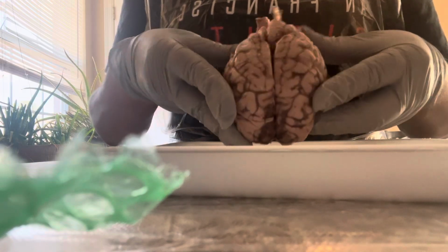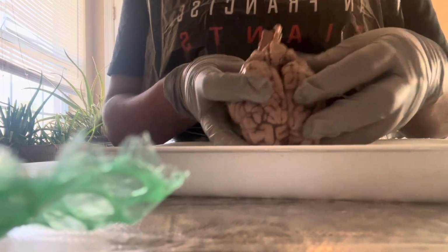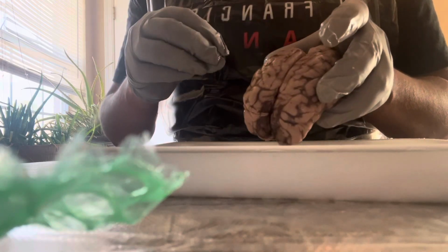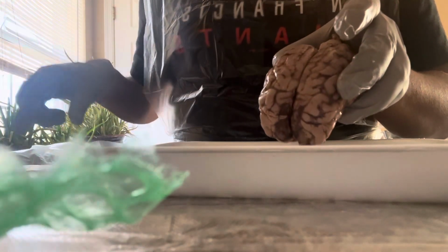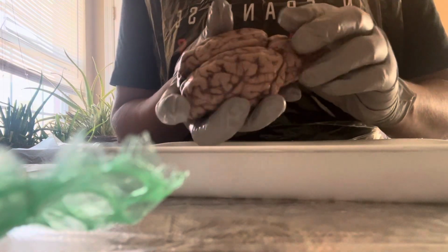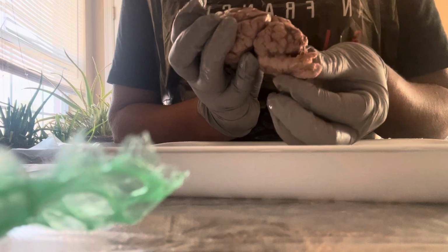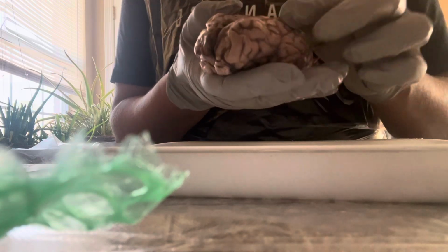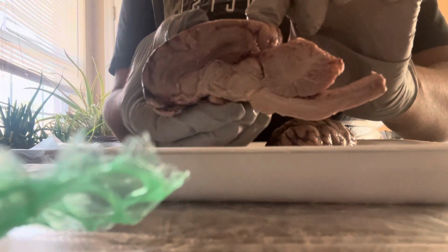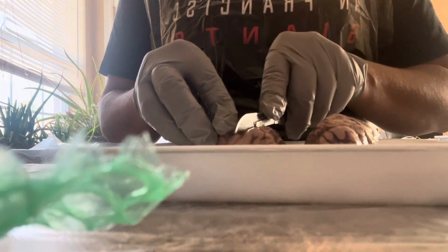So as I had explained at the beginning, our brain has two hemispheres, which I did cut right in the center in between. And it does have the cerebrum, which is this part. We have the cerebellum, we have the spinal cord, and then we have our gyrus or sulcus, which is like the grip of the brain. And then of course we cut it in half, and we were able to see the inside part of it. I find this very interesting, as it does look a lot like a human brain.